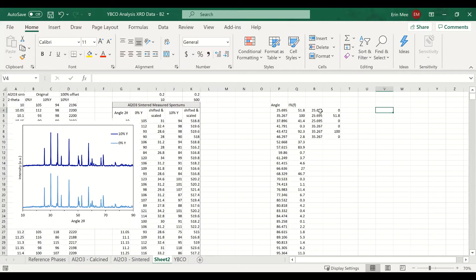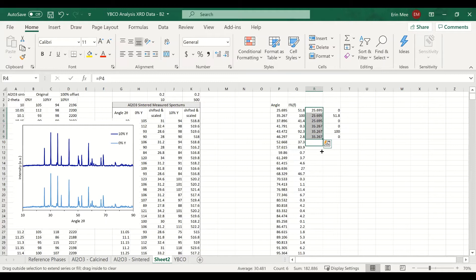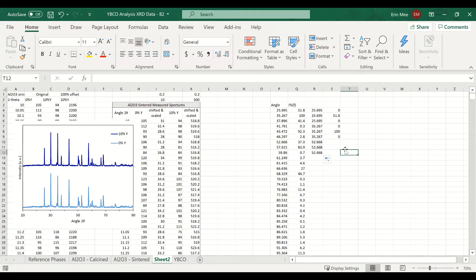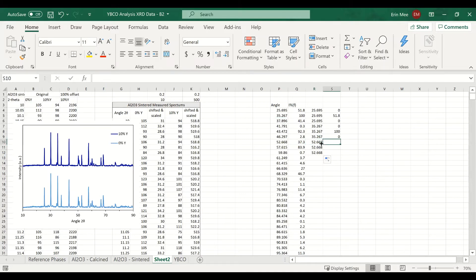Ideally we'd just copy this pattern down, but as it is now that doesn't work. Instead of Excel pulling the value from above, it pulls the value right across — so it references the wrong cell.